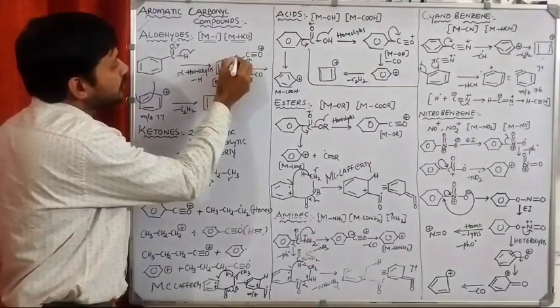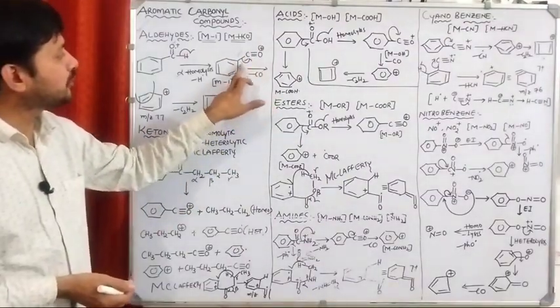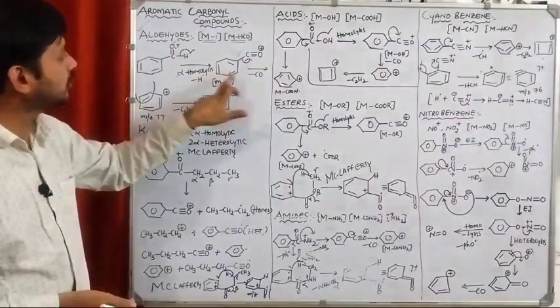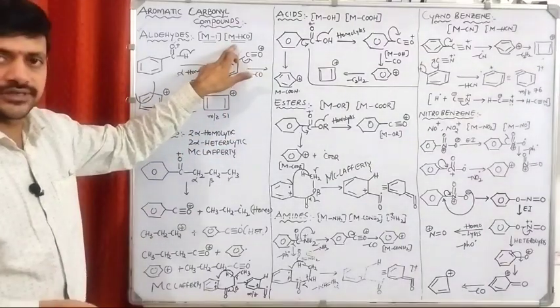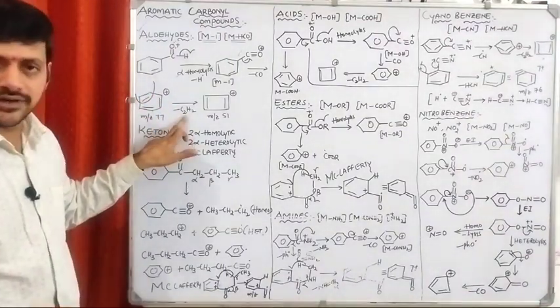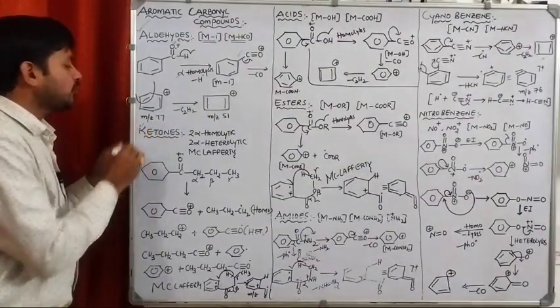After that, what are we doing? This bond is subjected to heterolytic cleavage. Thereby, CO will be removed and the phenyl group will get the positive charge. So, CO removed and H removed. So, this peak is going to be what? M-HCO. We all know that the benzene ring is subjected to further cleavage by the elimination of acetylene to form a 4-membered ring.